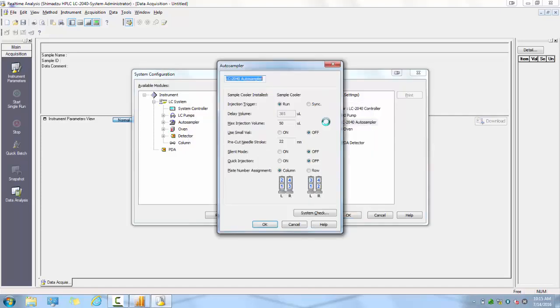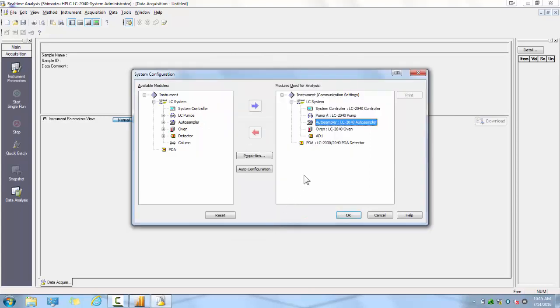For the auto-sampler, you will see options for injection trigger, small vial, silent mode, quick injection, and plate number assignment.